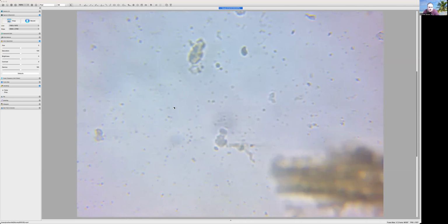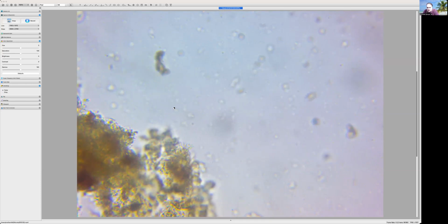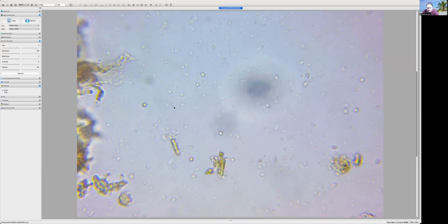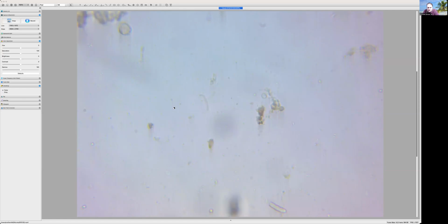That shadow is possibly, I feel like how those shadows appear, just tracking and getting up and down through this column is so hard.